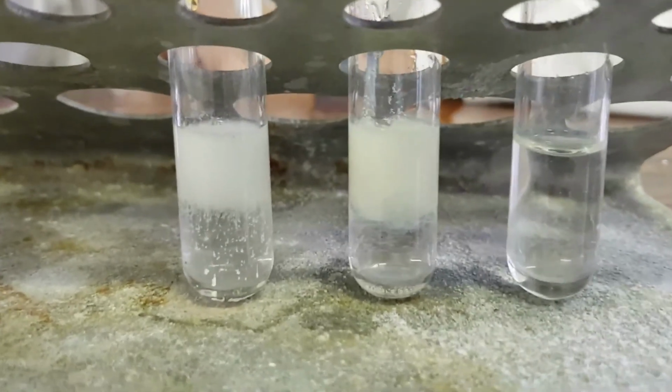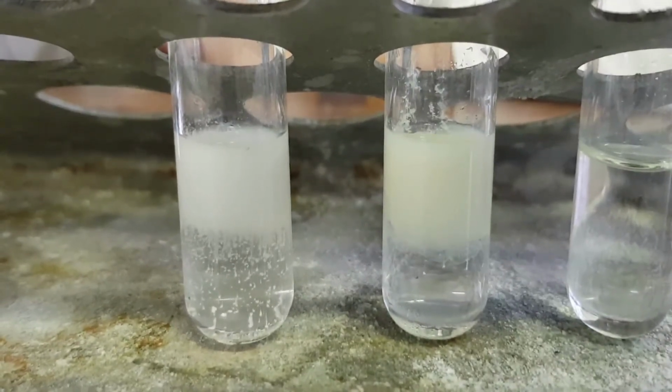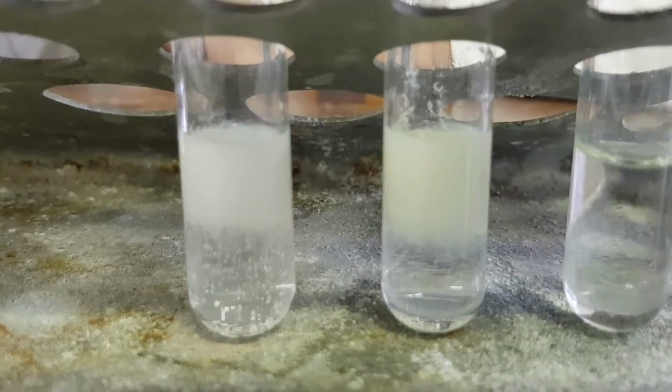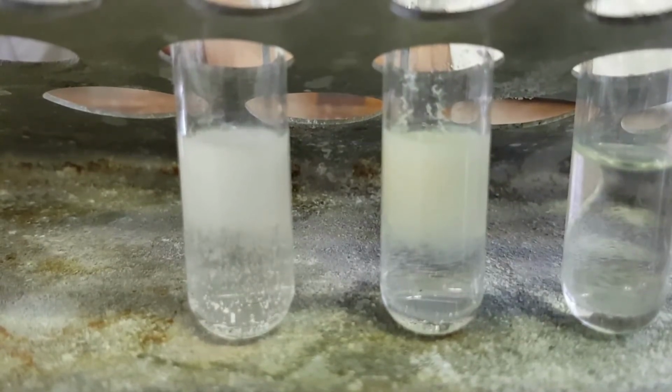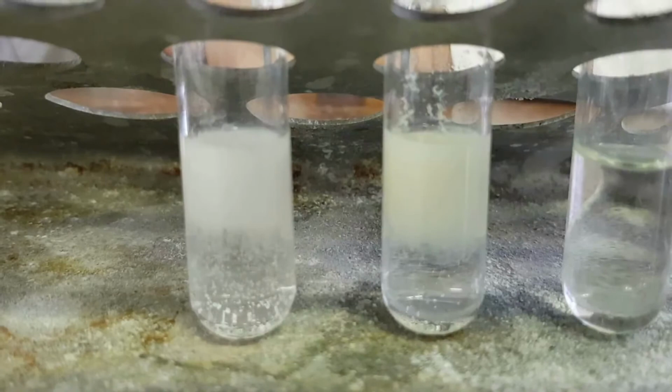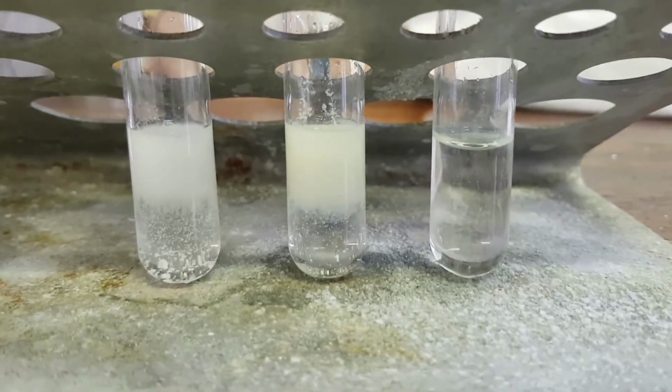Now, when these two are compared, it is obvious that the bromide is a creamier colour. If you just saw the bromide in isolation, it would be quite difficult to say that that was cream rather than white. But when seen next to the chloride, it's obvious they are very different in colour.